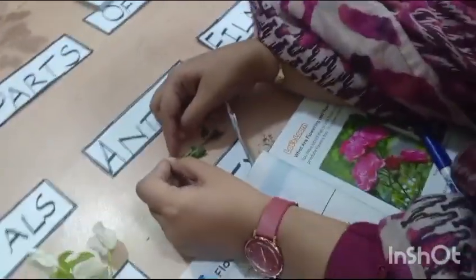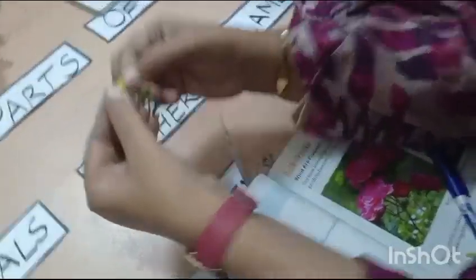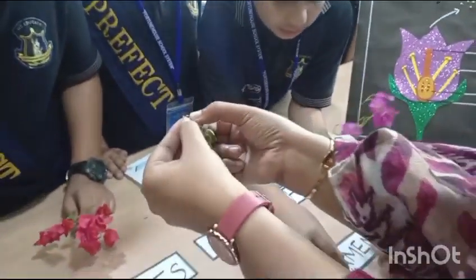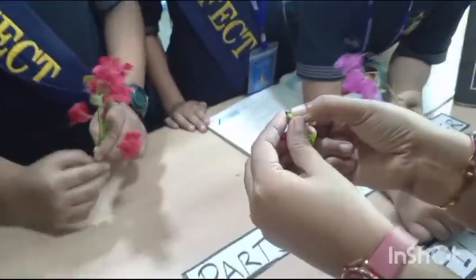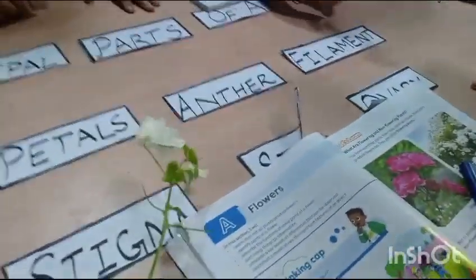Oh wow, this is a very thin part of the flower, which is called the style, and this is the stigma. The stigma is the female part on which pollen grains land, which receives the pollen grains.